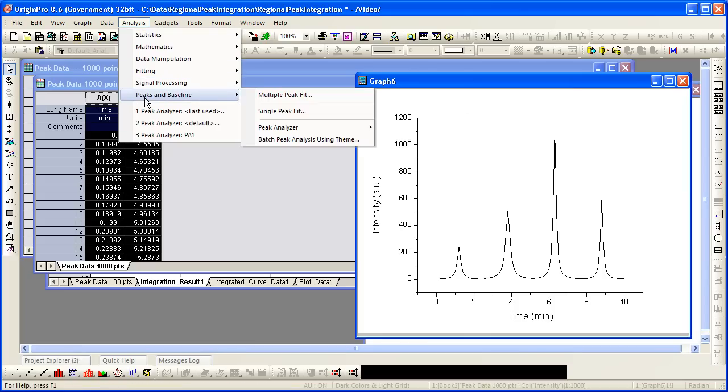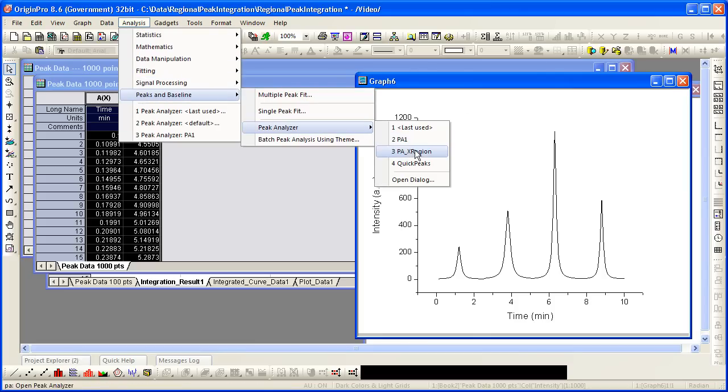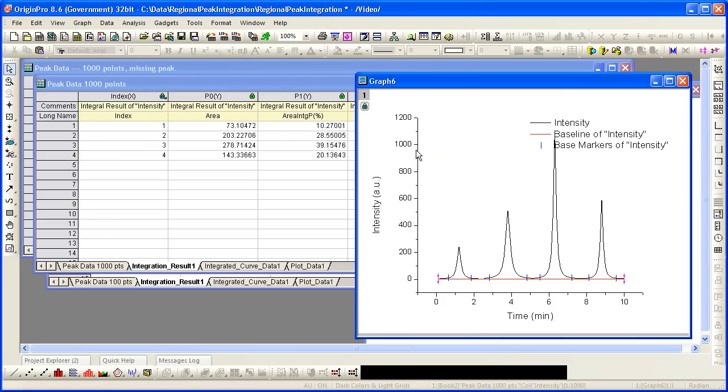So now since I have my theme saved, I simply go to peak analyzer, find the theme that I want, select it and the analysis proceeds automatically.